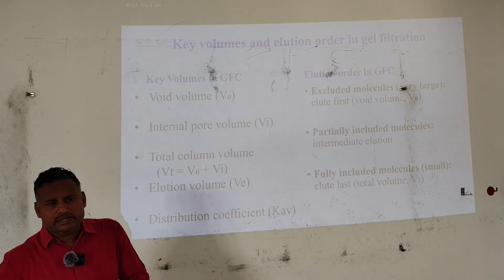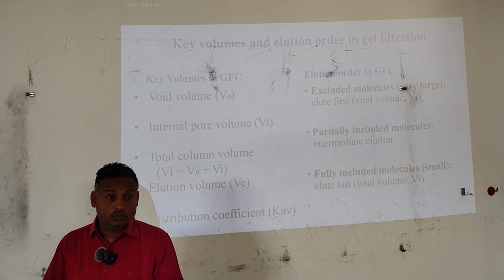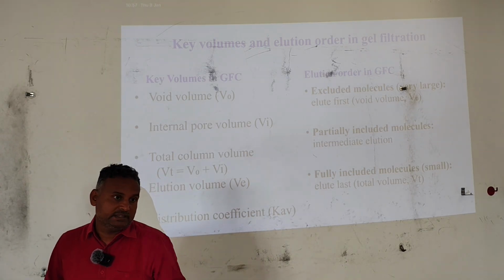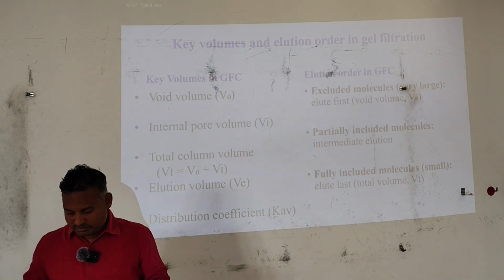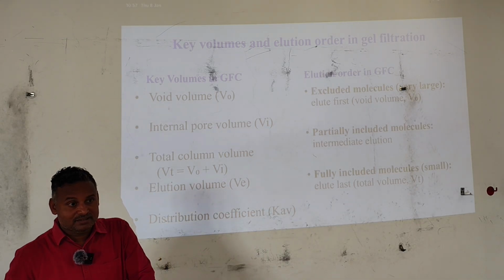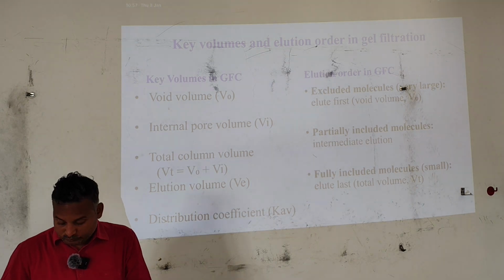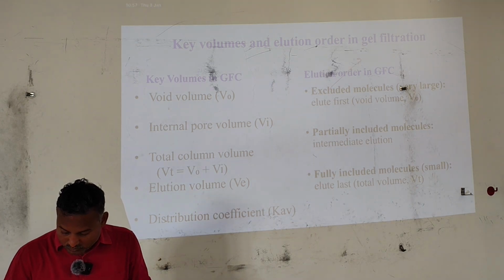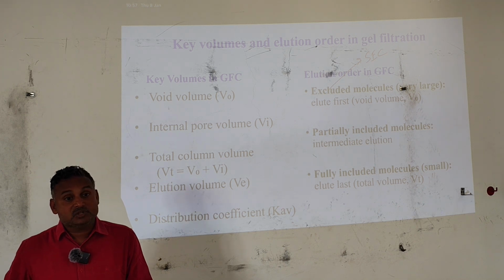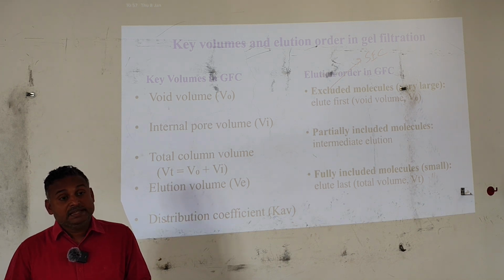See, excluded. That's why, as I already told you, SEC, size exclusion chromatography. The exclusion came from this. From this, we have the term SEC, size exclusion chromatography.